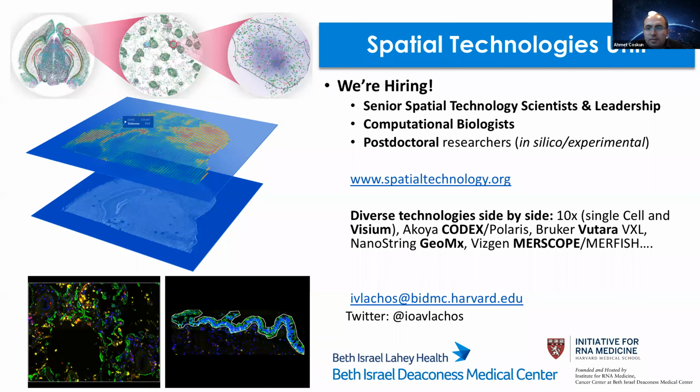Exactly. And also for the technical concerns, again, the FFPE versus fresh frozen directions, right? When people are interested in either or both, which one would you recommend? Is FFPE really a loss of a lot of antigens and RNA molecules, or are they still good to capture, let's say, the phenotypes in multiple disease models? Yeah, that's a good question.